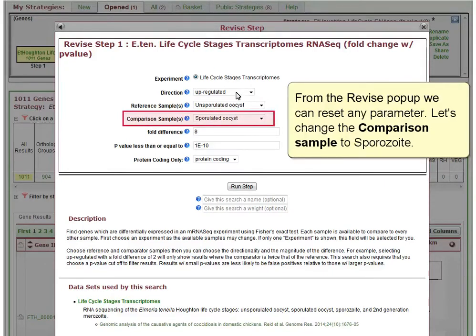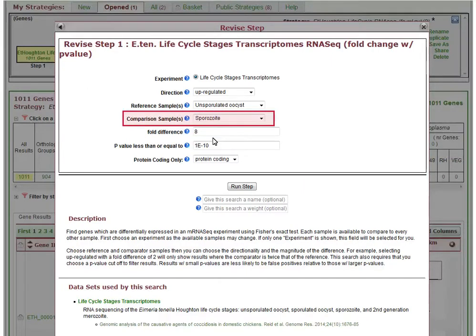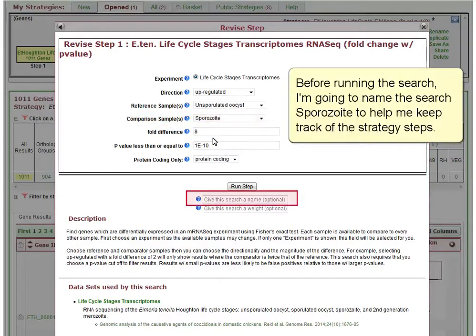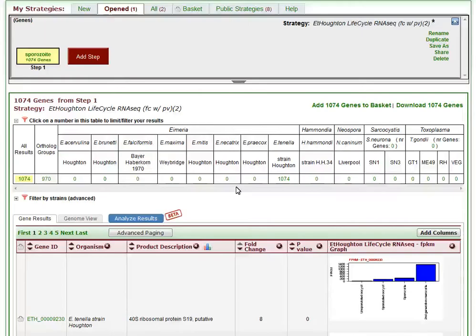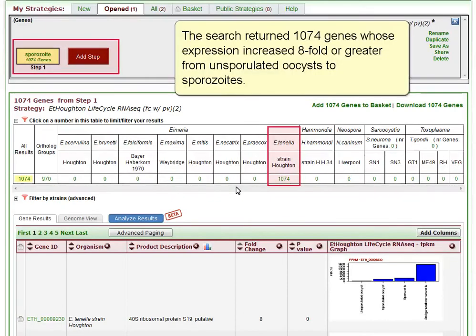Let's change the comparison sample to Sporozoite. Before running the search, I'm going to name the search Sporozoite to help keep track of the strategy steps.